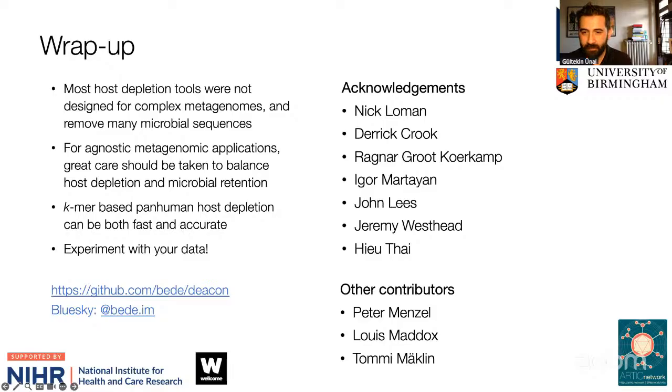Okay. Thank you. Shall I look through? Shall I try and answer these questions in the chat? There are a couple of things. I can read it to you out loud for everybody to read. So a lot of thank yous. Some people want to test it with their own data. And one question: by how much do you believe this approach will make dehosting faster in comparison to, say, standard read mapping against the human genome?